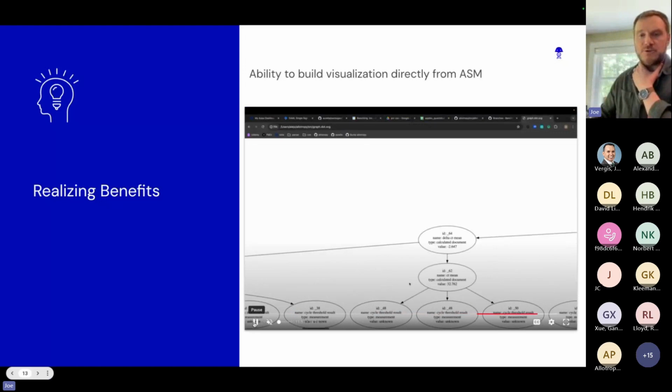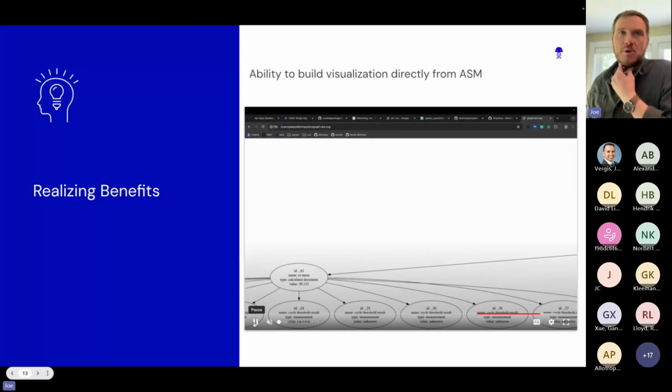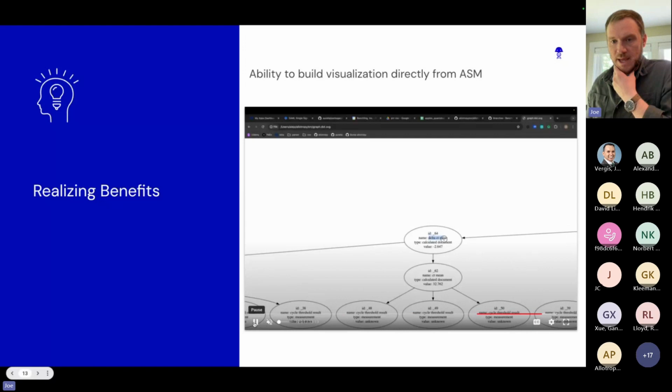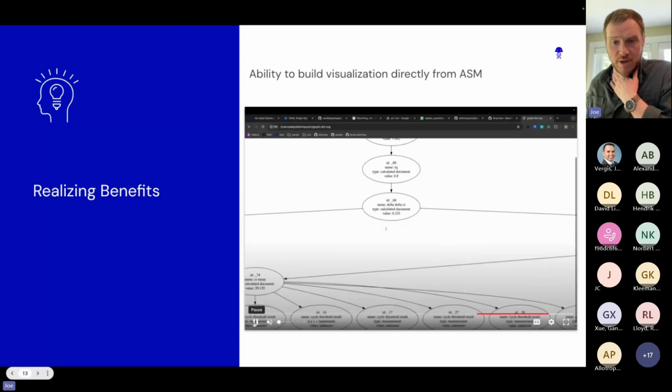And why we actually think this is really powerful. One, it's a good validation tool for, are the relations between the data what we expect? But also, I think one of the goals of tools like the ASM is that it is meant to document this data for people who are not practitioners of this technique. And if you are someone who isn't deeply familiar with qPCR, do you know how a delta delta CT value is actually generated?